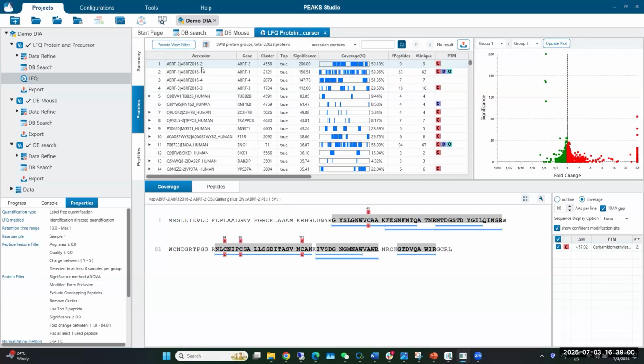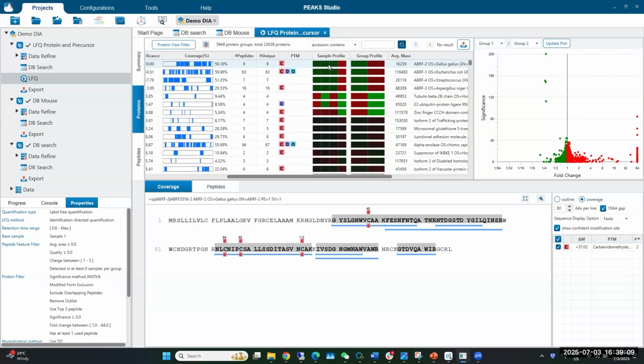You can see for the four spike proteins there are significant changes between the groups on the top. If we look at this protein, this is each individual replicate. One has 50 nanogram and another is 200 nanogram. You can see those are three replicates, and this is their ratio. Between replicates they are very consistent. And then this is the final ratio. The theoretical one is 1 to 0.25, and now it's 0.28. I think that's pretty good accuracy.